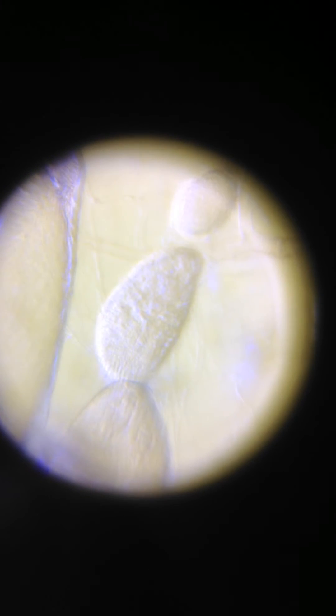It's the sheath. There, and that's the follicle cells. You see them arranged? So that actomyosin paper that you sent out is these cells, except in a belt.